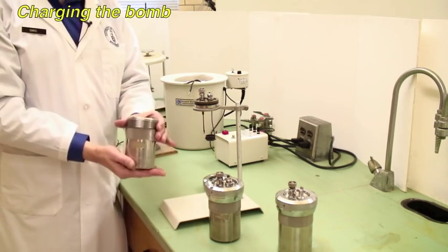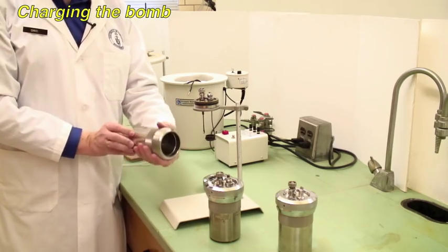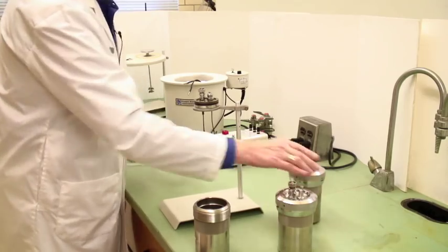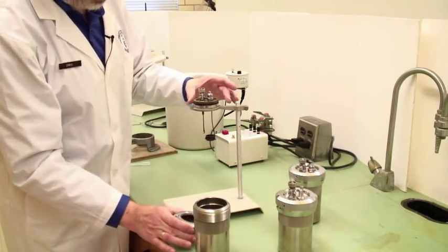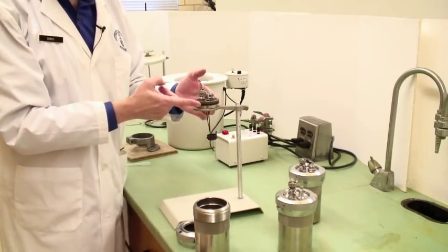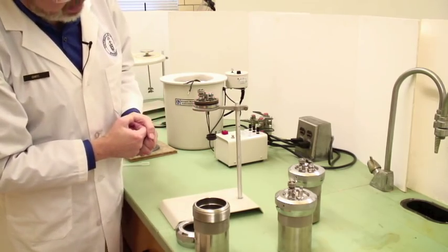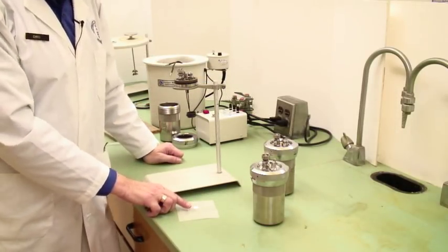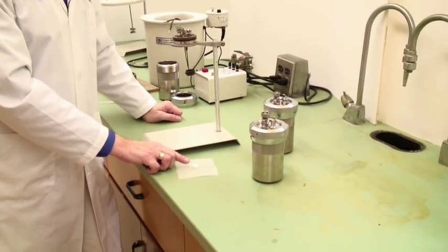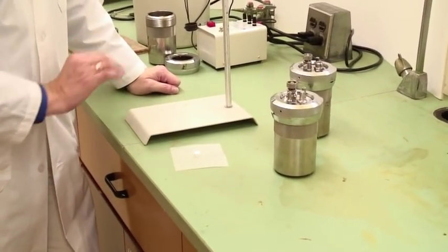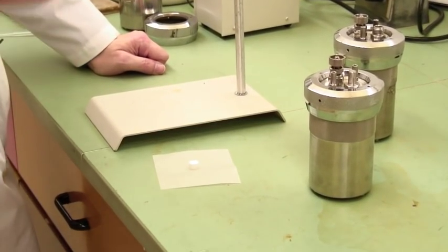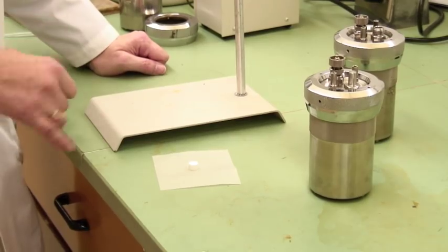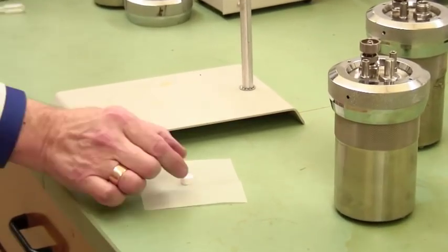The bomb itself is just a stainless steel can with a ring attachment and the bomb head. This is where all the high technology is taking place. This is actually a tablet of about one gram of benzoic acid, and we use this to actually calibrate the bomb itself because benzoic acid has a known heat of combustion.